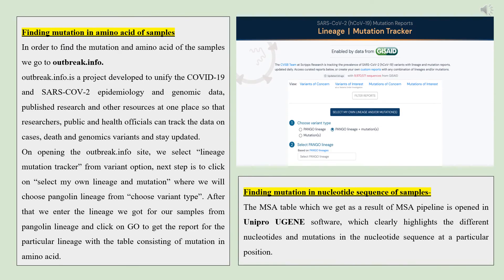Mutations in amino acids are found in samples using outbreak.info, where the lineage mutation tracker is selected and then 'select your own lineage' is used. Next, click on 'choose variant type and mutation' and enter the lineage of the sample to find the mutations. Using UGENE, the MSA pipeline is opened, which highlights nucleotides and the mutations.